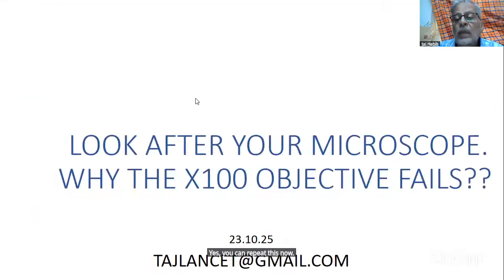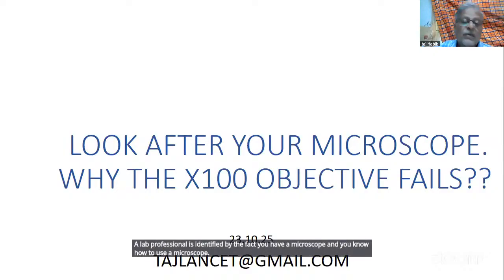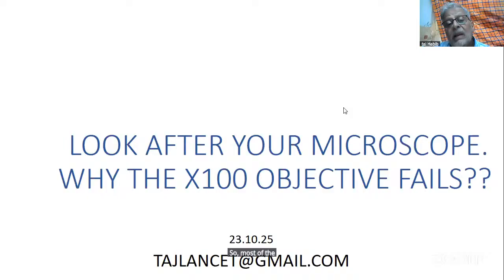So how do we look after our microscope? A microscope is the most important instrument in the lab. A lab professional is identified by the fact that you have a microscope and you know how to use a microscope. So most of the microscopes in the market now are either Chinese or Japanese. The Chinese one is model 107. The Japanese one is Olympus CX21 or 23.